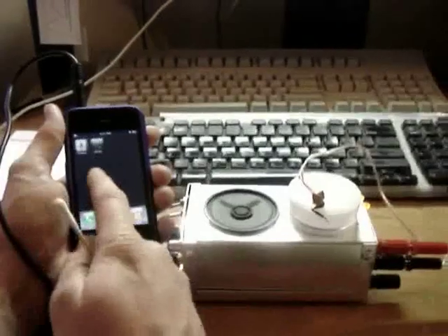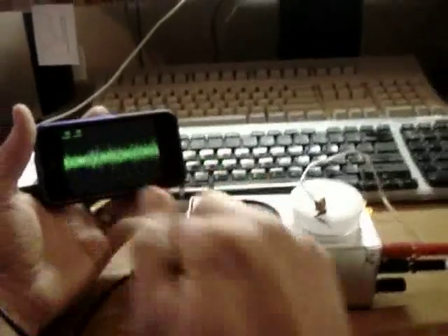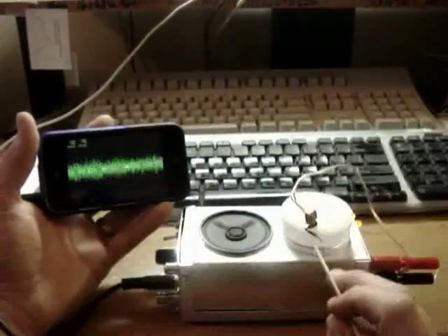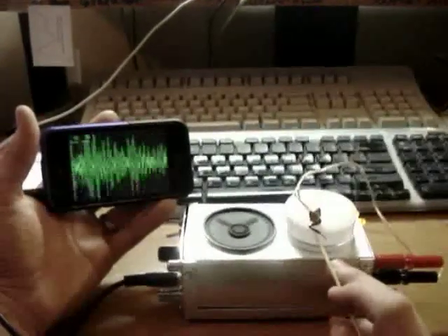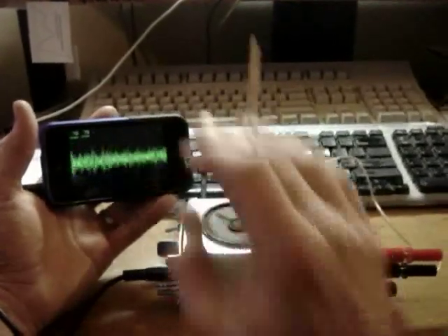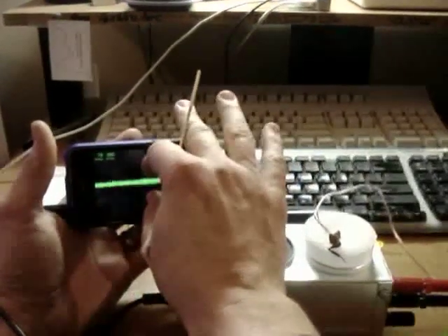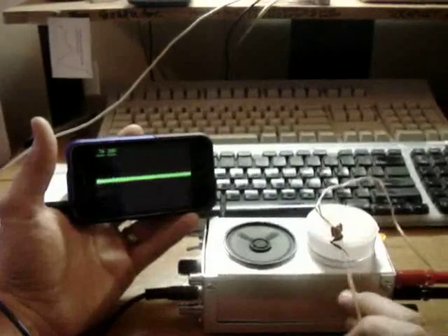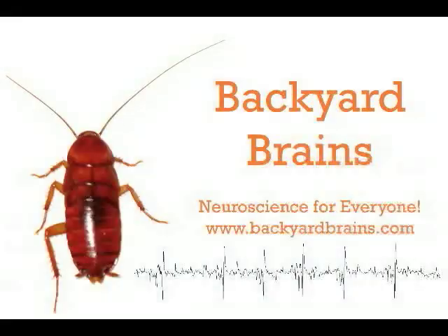What if all I have on me is my phone? Can I then still record nervous system activity, especially with how powerful phones are becoming nowadays? Well, here we officially announce the Backyard Brains iPhone application, coupled with our Spiker Box, for recording the nervous system activity of invertebrates. You can see we have zooming in on amplitude and the time range, and you can very nicely see the evoked discharge of the leg, and you can record it on your iPhone.